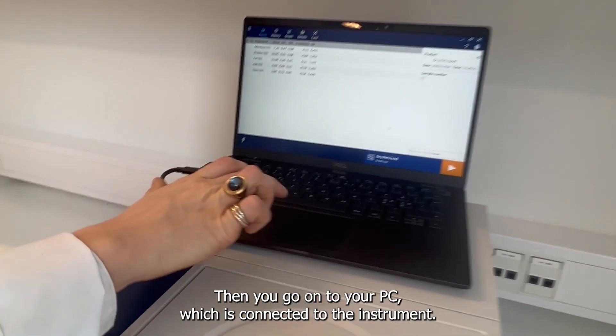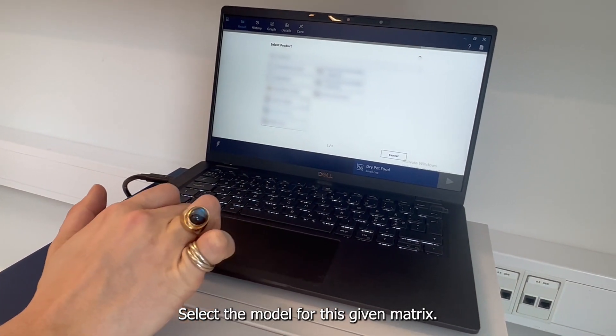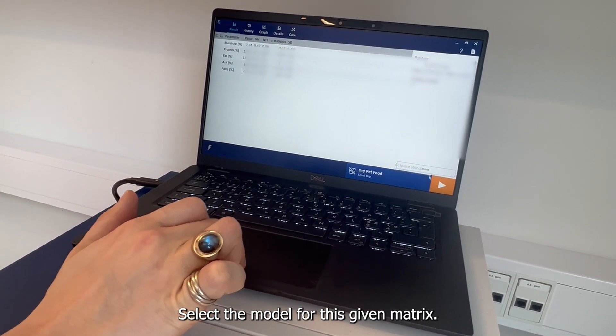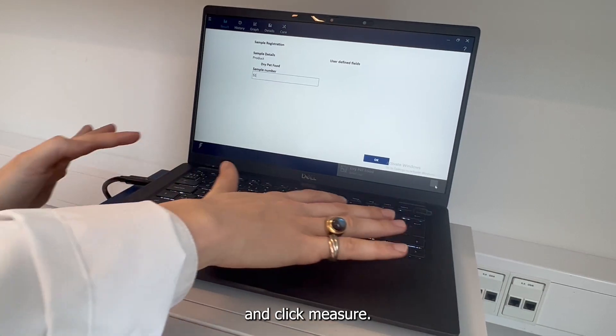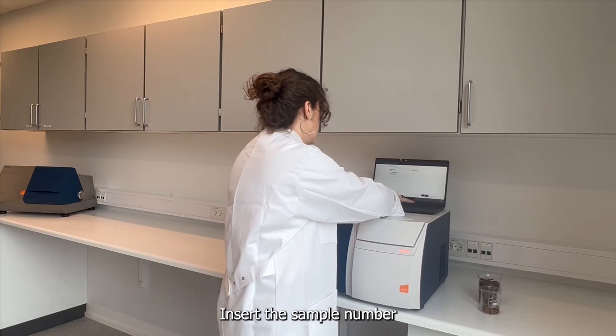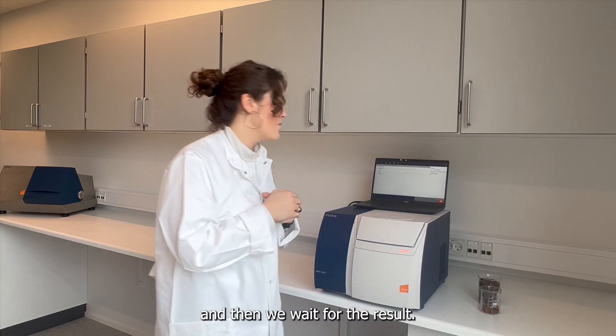Then go to your PC, which is connected to the instrument. Select whatever model applies to this given matrix — here we have dried pet food — and click Measure. Insert the sample number and then wait for the result.